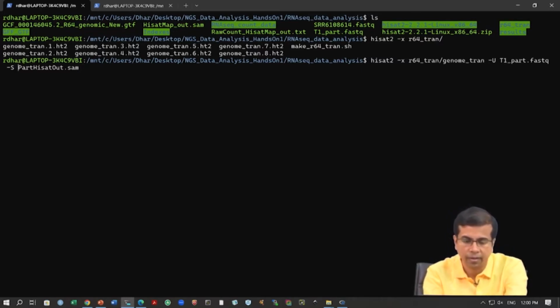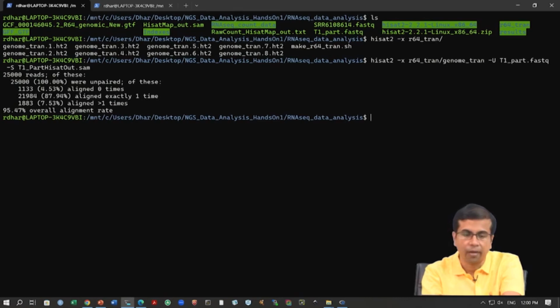Okay, maybe we can just say T1 part, right, because this is from the T1 part file. All right. So, let us run this and see. Okay. So, what is the output? We have 25,000 reads. These are unpaired reads. Then it gives very similar statistics like before.